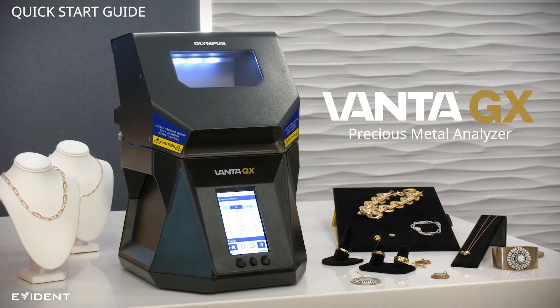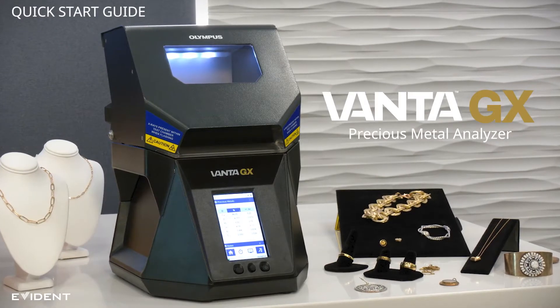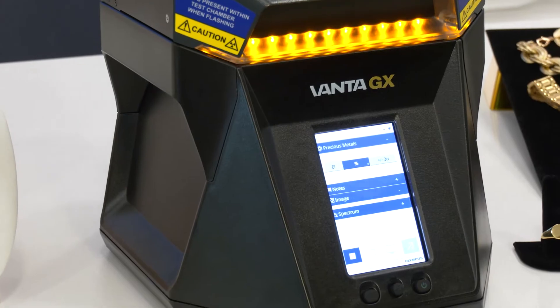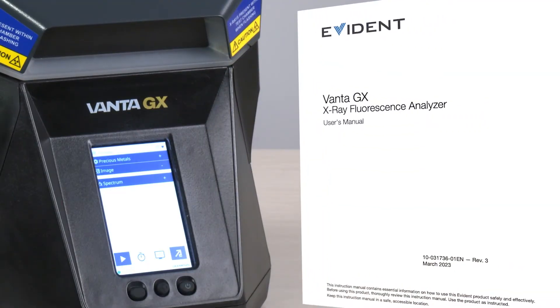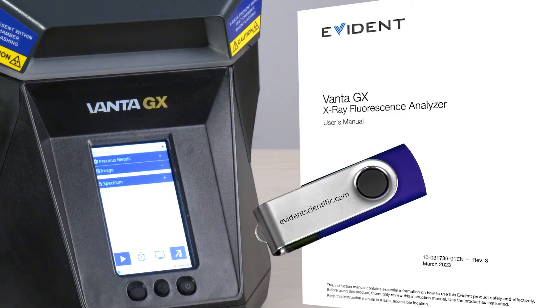This video will show you how to use the Vantage EX Precious Metal Analyzer from start to finish. Learn how to perform a test and export results in a few easy steps. All this information can be found within the user manual. Find a PDF of the manual on the USB drive included with your analyzer.